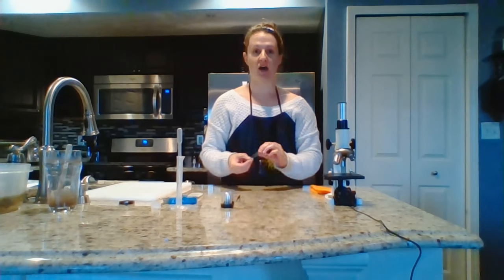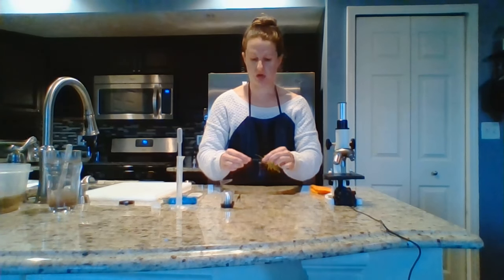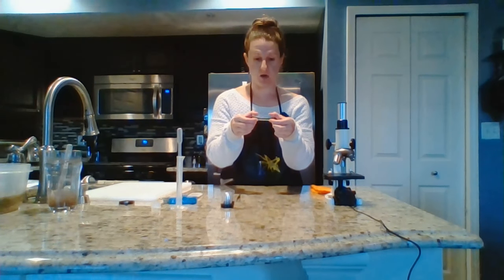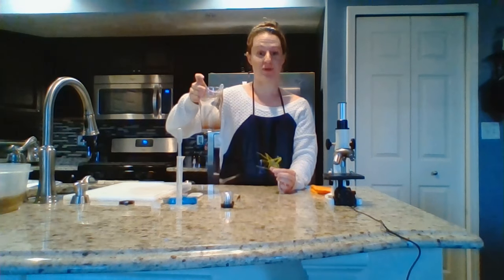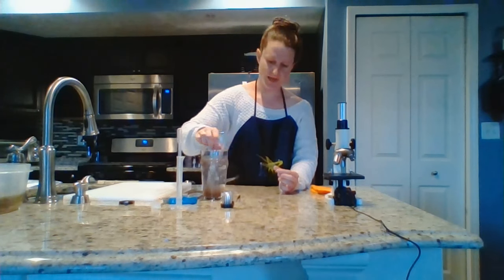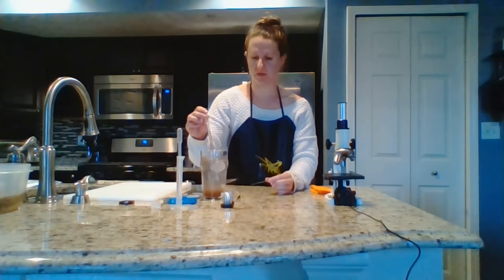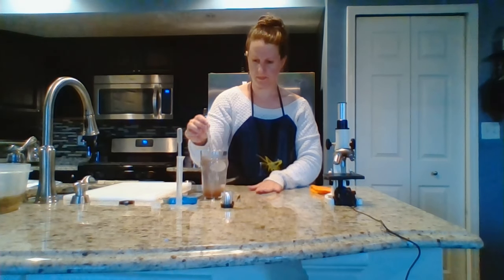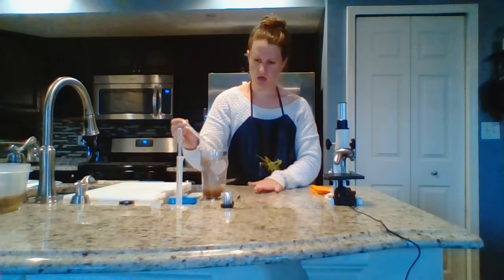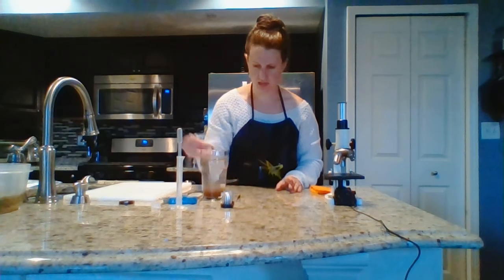Next, we're going to prepare our wet mount slide for part 2. To prepare our wet mount slide, you need a clean glass slide and your brine shrimp. These guys should be hatched already and should have been sitting in a well-lit area for about 24 hours. Placing your slide on your countertop, grab a drop or two of brine shrimp and place the drop right onto the slide.